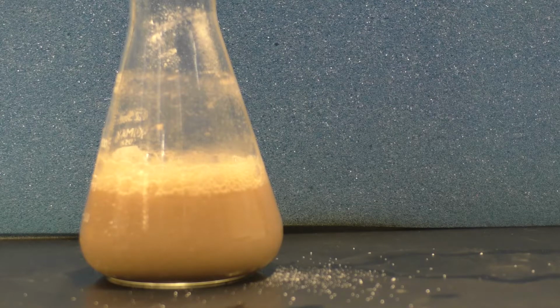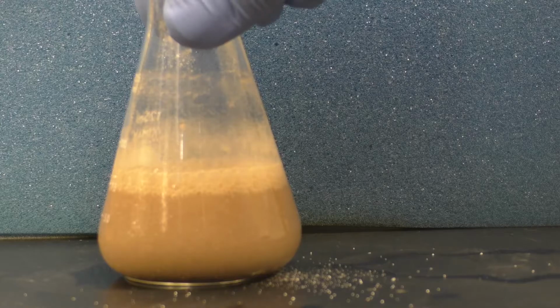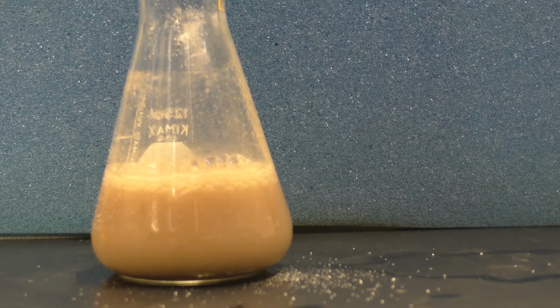So now notice a few things. First, we're not getting as much bubbling. That's definitely subsided some. And also, the solution is now very chunky. There's a lot of solid precipitate there. Any bubbling we're getting seems no longer to really be foaming.